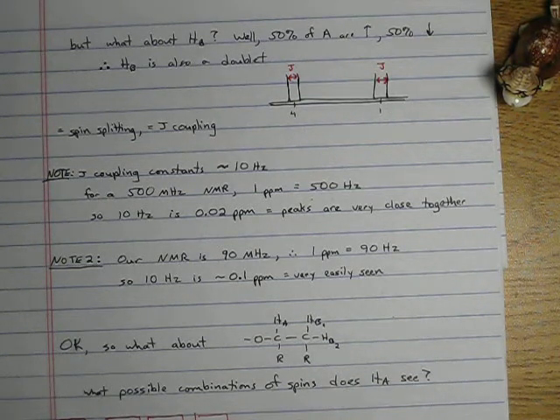together. On some of the spectra that we're going to be examining, you can tell they were run on a 500 megahertz instrument, one of your more common instruments, because you can't even really see the splitting. Someone had to go in and magnify it to show you, oh, guess what? This was a doublet here, because just by looking at it, you couldn't see because those peaks are so close together.